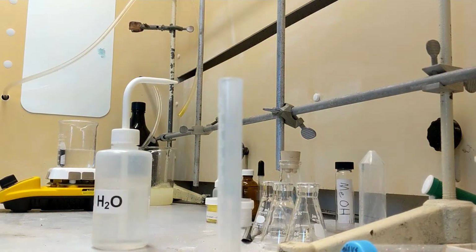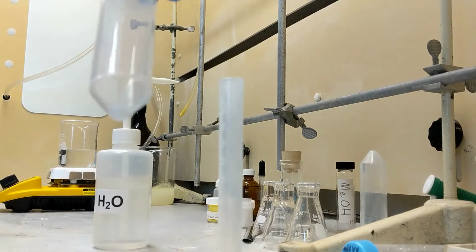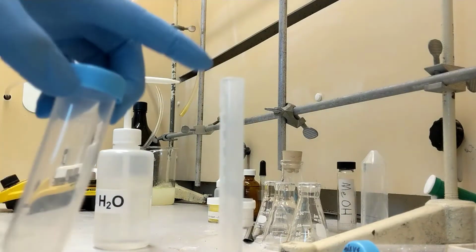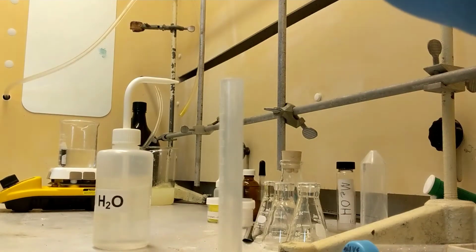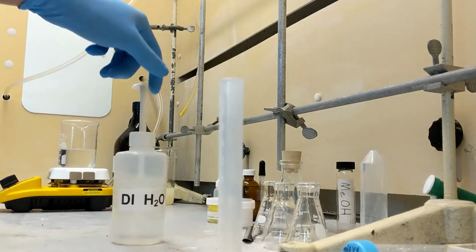Alright guys, we're going to go ahead and start experiment 3B. Experiment 3B, I added succinic acid into this centrifuge tube. It's in there right there at the bottom, you see it. Added about 0.1022 grams of succinic acid. That's what's sitting down here. You'll get the exact measurement at the end after I show you the data. To this, I'm going to add 4 milliliters of dichloromethane or methylene chloride and 4 milliliters of DI water. I'm just going to do that now.